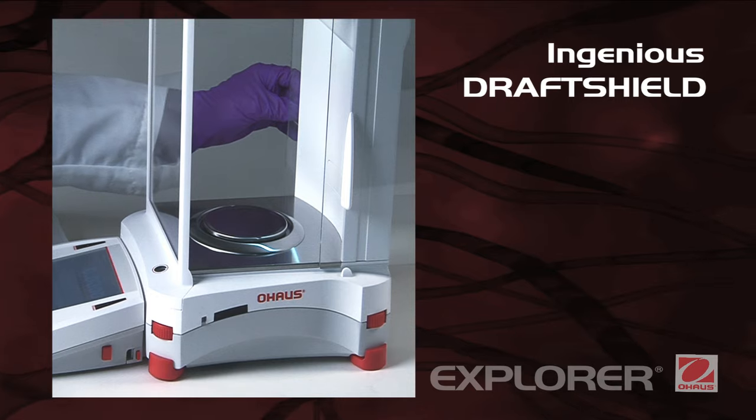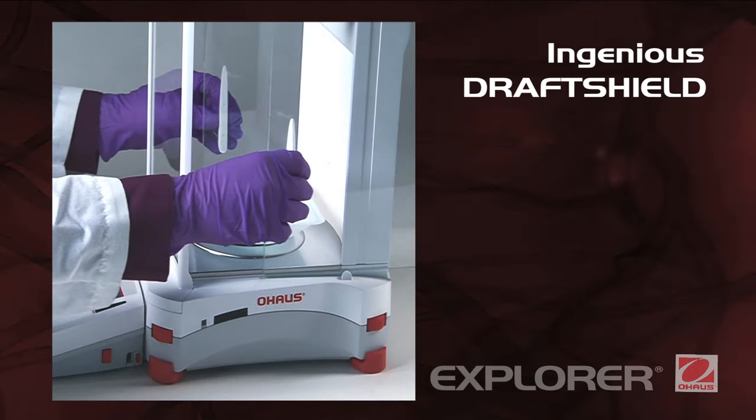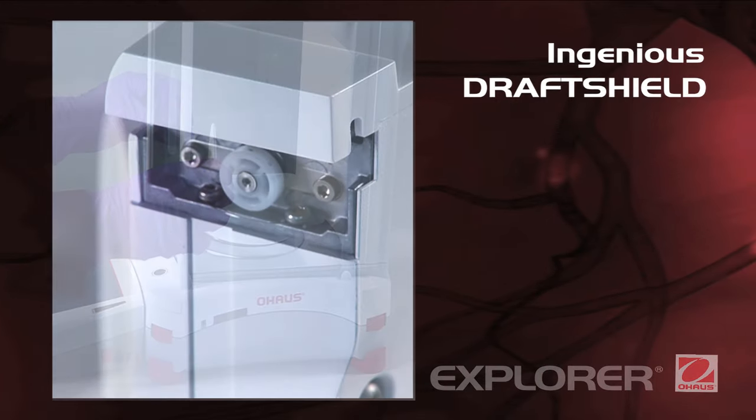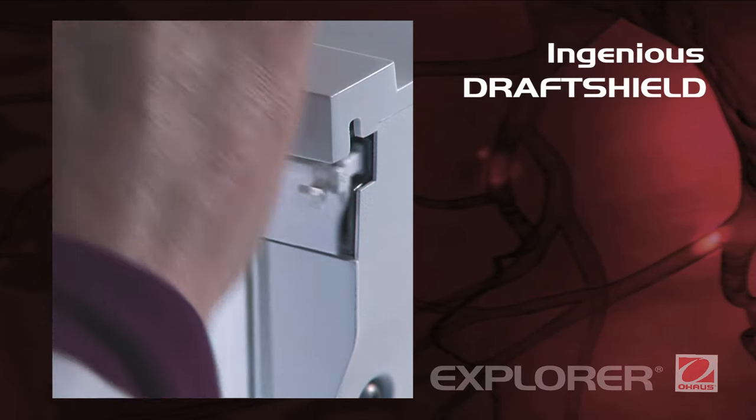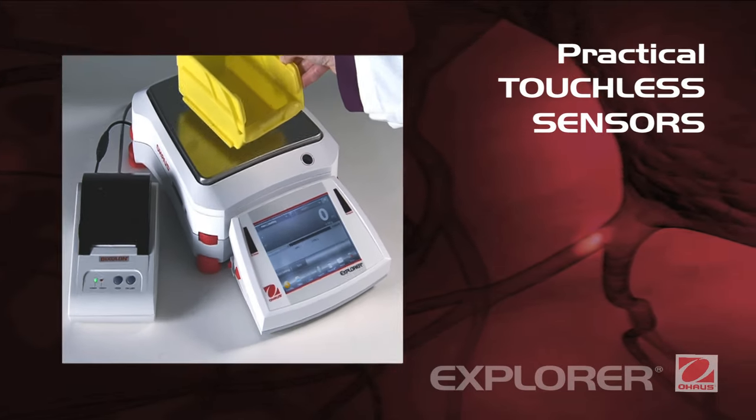Ingenious DraftShield. Explorer's DraftShield provides ample access and visibility to the weighing chamber and features anti-static coated glass. Its side doors glide seamlessly on top-mounted bearings.